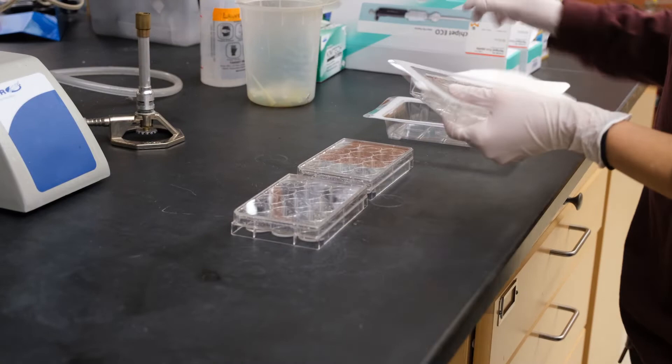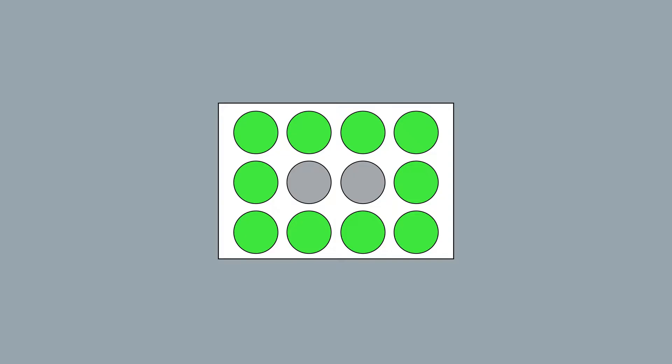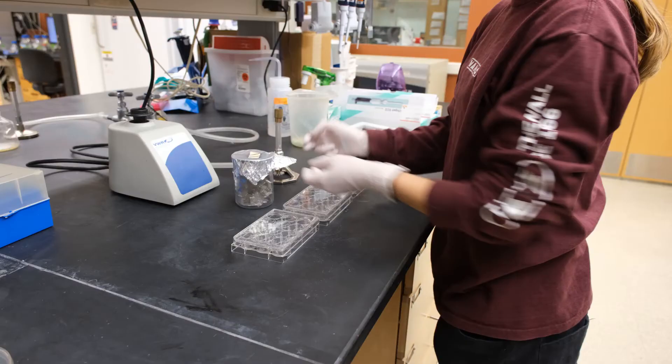So to begin, unpackage your sterile 12 well plates, however many you're using. Don't open the lids, set them out on your bench. In the 12 well plate, the outer wells are good for biofilm growth, but the inner wells don't grow nice, reliable biofilms. We suspect there's a lack of aeration there. You can use the center wells as negative controls for growth, but we don't recommend using them for your experimental biofilms.